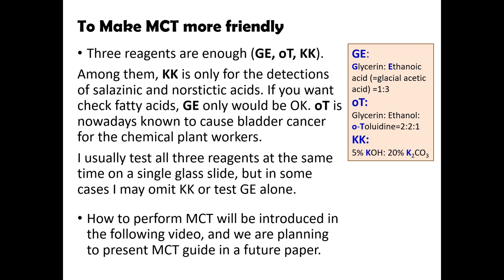I usually test all three reagents at the same time on a single glass slide, but in some cases, I may omit KK or test GE alone. How to perform microcrystal tests will be introduced in the following video. And we are planning to present a microcrystal test guide in a future paper.